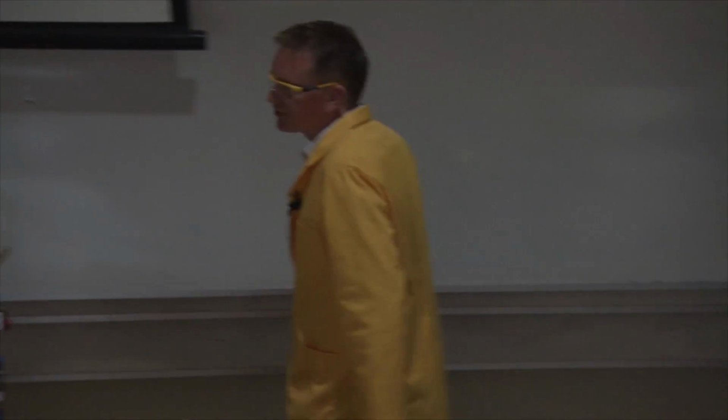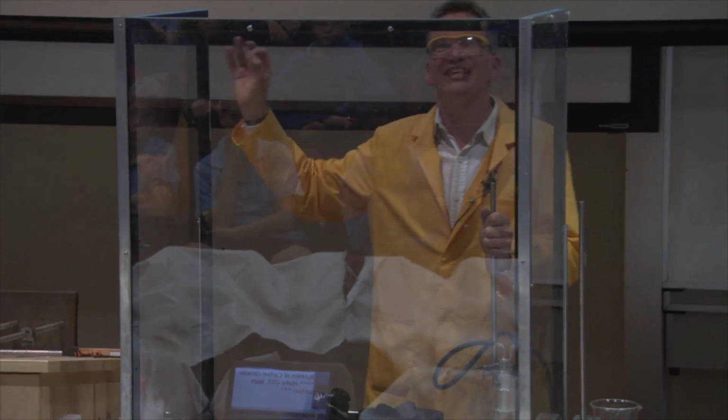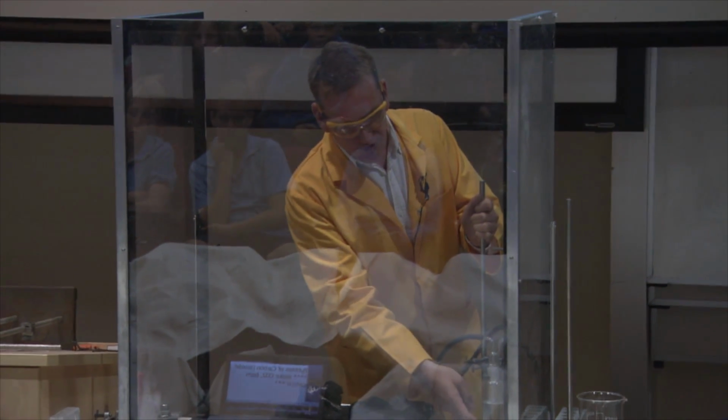So there's a nice chemical test to detect the presence of carbon dioxide. And this involves a new chemical. This new chemical is called lime water. This is the one that we used before, remember. This is the alkali, the calcium hydroxide. This is dissolved in the water here. So this is our lime water.